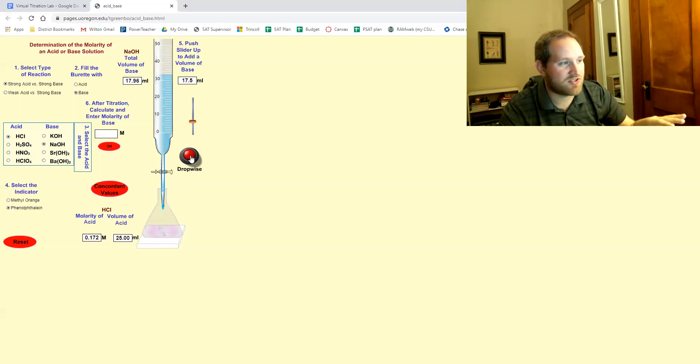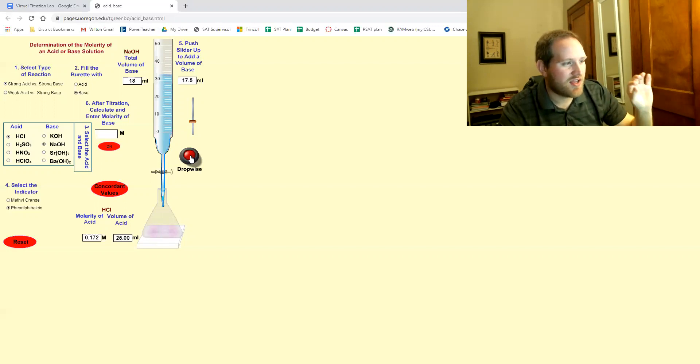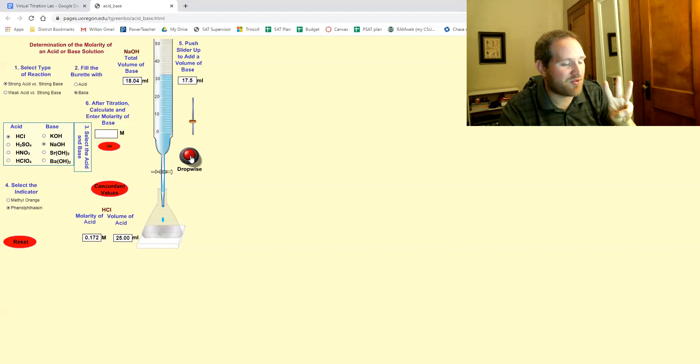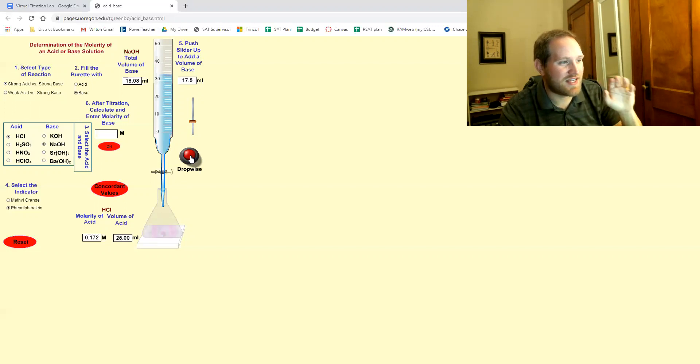Now I've done this lab a bunch of times in preparing this. You have a three drop window where it stays pink for three drops. Which by the way, is more generous than real life.